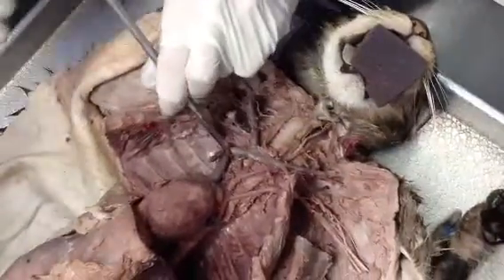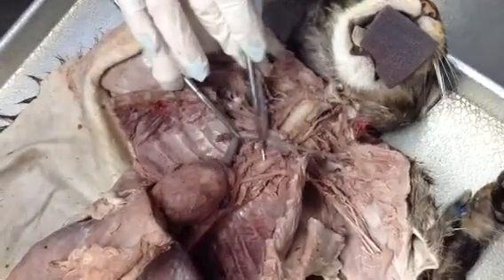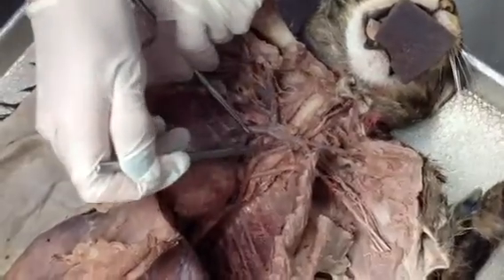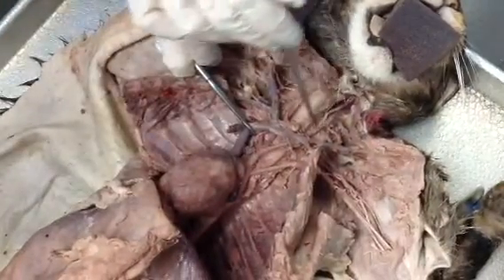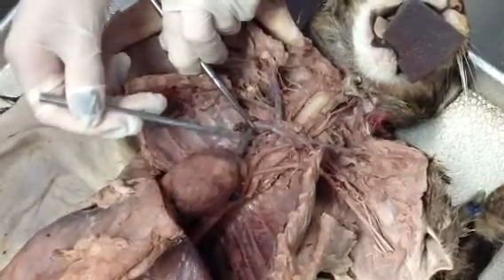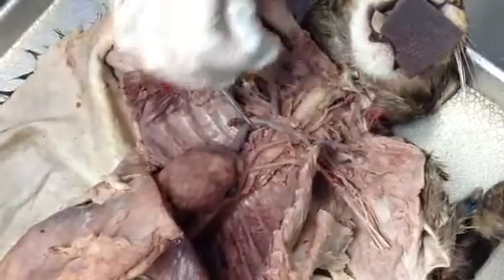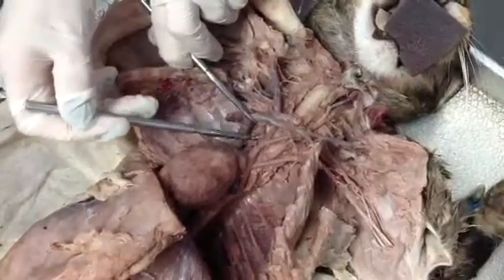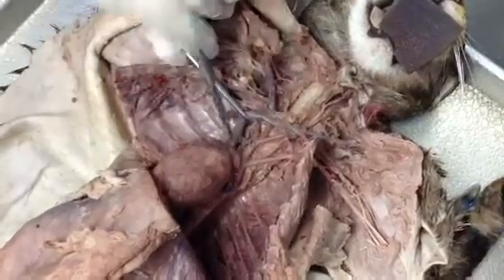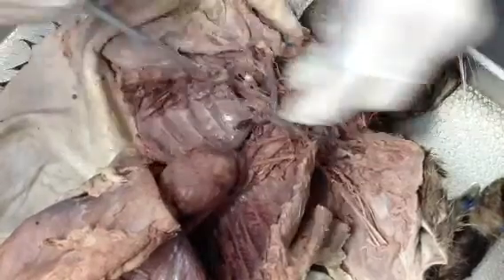Okay, so here the first one that branches off, that is the left common carotid artery. So it comes off here, goes underneath the brachiocephalic, and it extends all the way up. Then the middle one, that would be the right common carotid artery, also goes underneath and goes all the way up to the head and neck. And then here on this side, that would then be the right subclavian artery. So the left coming off here by itself, the right coming off the brachiocephalic.